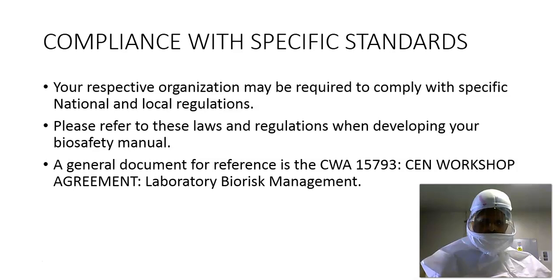Compliance with specific standards. Your respective organization may be required to comply with specific national and local regulations. Please refer to these laws and regulations when developing your biosafety manual. A general document for reference is the CWA 15793, also known as the CEN Workshop Agreement on Laboratory Biorisk Management. I will be covering this in another tutorial on laboratory biorisk management.